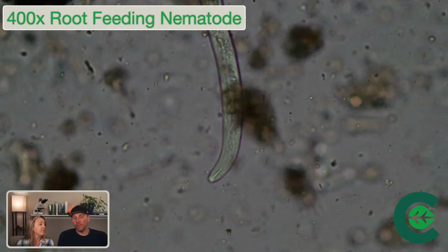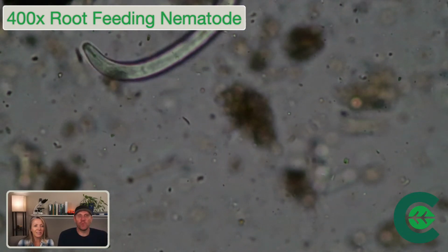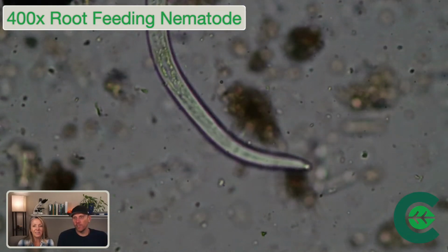And so I just paused it where she's talking about it. It's like a little needle in there. It's kind of funny, it looks just like the male genitalia, which is pretty funny. It's pretty clear when you see one, and it's fairly small compared to a bacterial feeder, which sometimes has a shoot, so it's a little bit longer than that. But you can see how the head is turning, but the spear is not, because it's an actual poker stick. So it stays pretty rigid, I guess you could say.